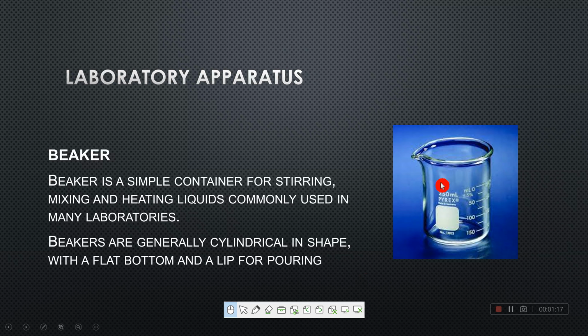and it has a protrusion which is helpful for pouring out the solution. Alright, it is a simple container. It is used for stirring, mixing and heating liquids, commonly used in many laboratories.